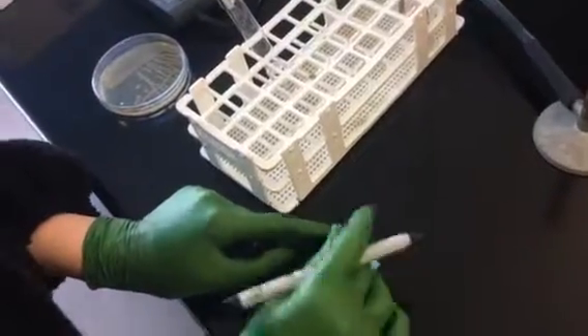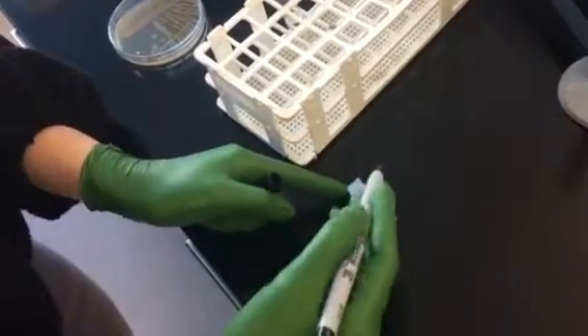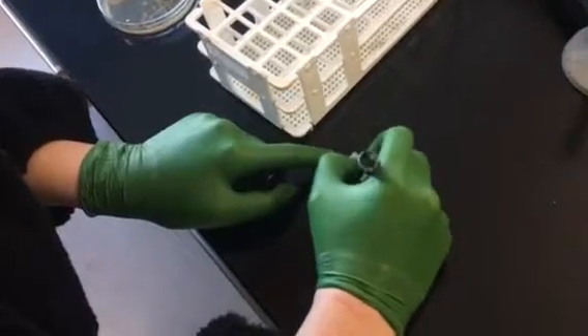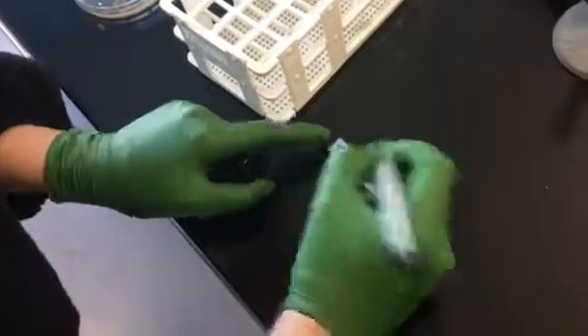The first thing you want to do is label a piece of tape with part of the edge folded over with the name of the bacteria, your initials, the date, and your section. Then put that directly onto a tube with five mils of saline.